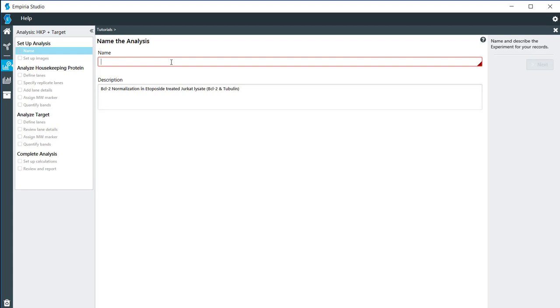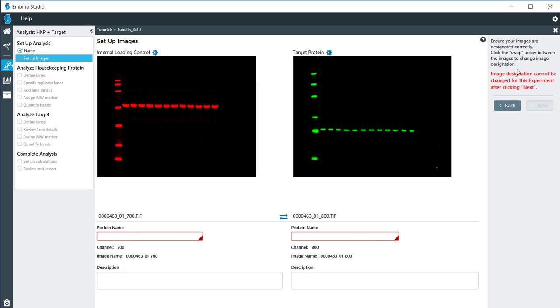The images that I have on here have both tubulin and BCL2. So I will label these as needed and then click next.